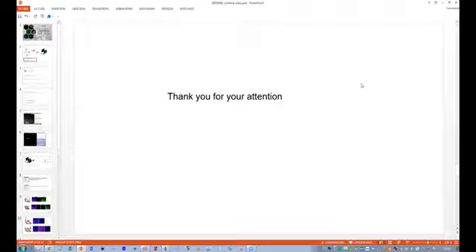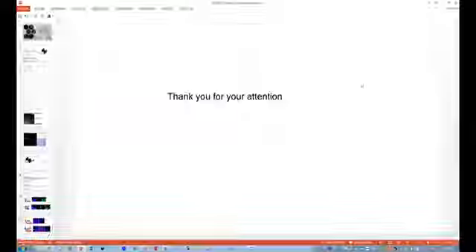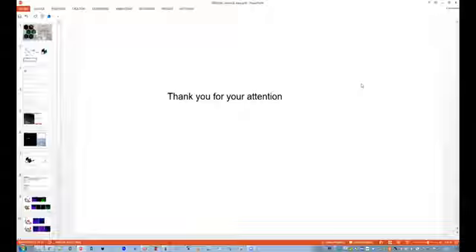I have a question / comment, I suppose. Juliette, we have already talked about this specifically for cyanobacteria when we looked at the data from the confocal. I just wanted to clarify. Towards the end, when you do the sum spectra of the fluorescence across the different slices, you see how many components you see, and whether they match your eigenvalues, which you use in your principal component analysis.